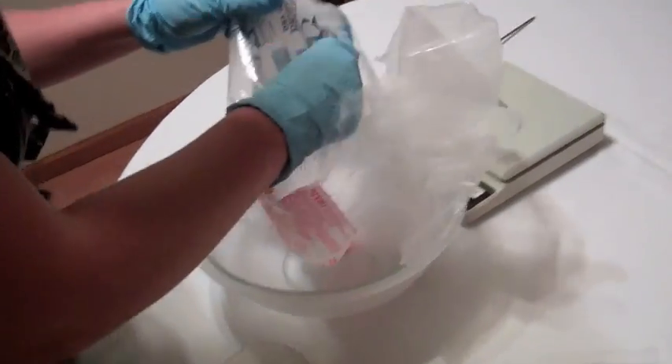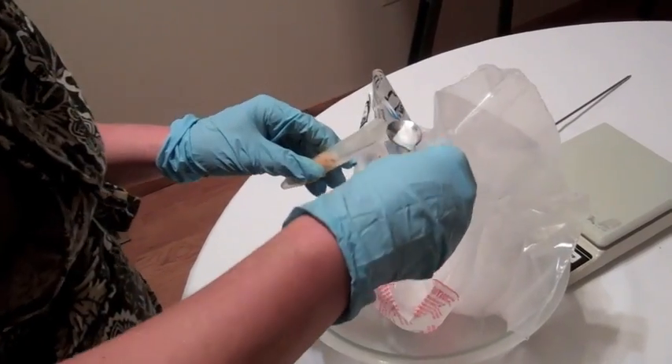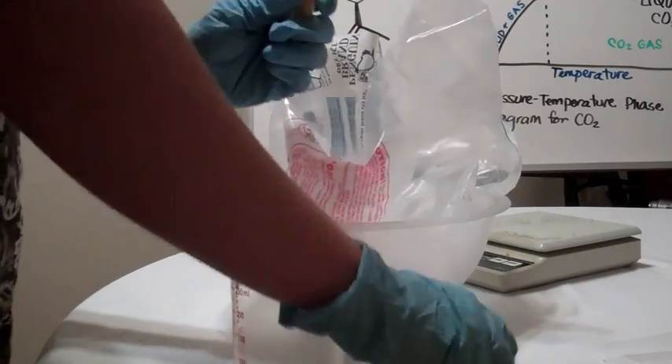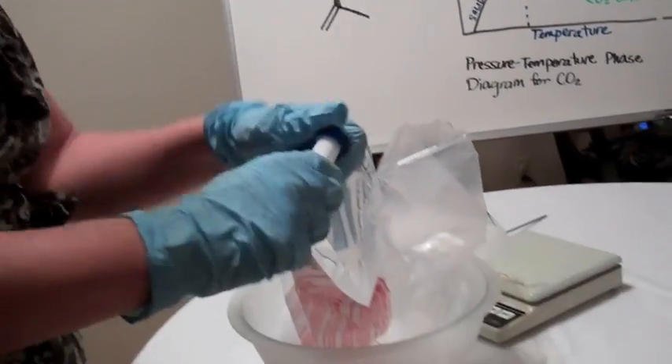We're going to add enough crushed dry ice to fill the top of the tube. Now you want to seal this cap on very tightly and straight.